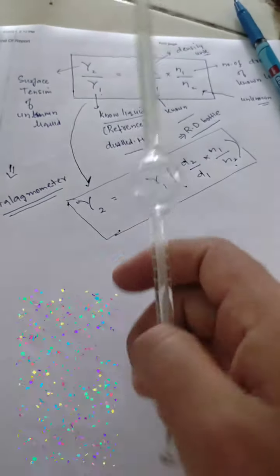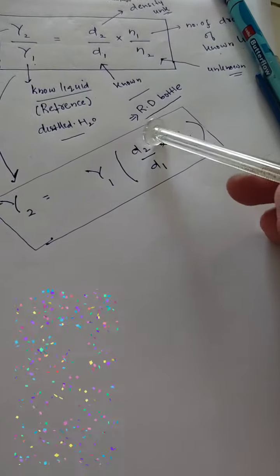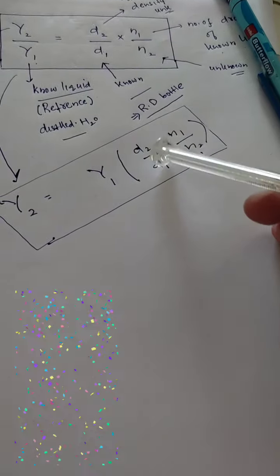Okay, तो कैसे करते हैं? How we calculate this N2, D2, N2 and N1. So let us say we have to calculate N1. So what we do, एक known volume of liquid, a given volume of liquid, will be filled. हम एक beaker में ले लेते हैं. ठीक. So we'll take that in a beaker or in any container. ठीक है. So we'll keep it here.